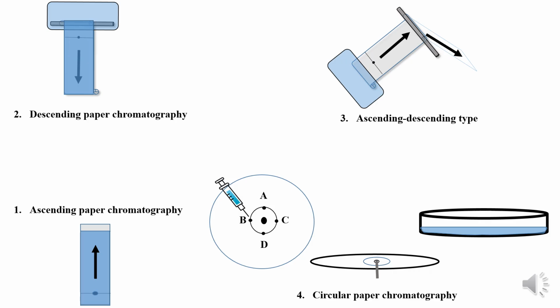Meanwhile, you can prepare a wick using a thread or Whatman paper, roll it up and pass it through the hole that you have made at the center of the Whatman paper. Even cotton wool can be used for preparing the wick.